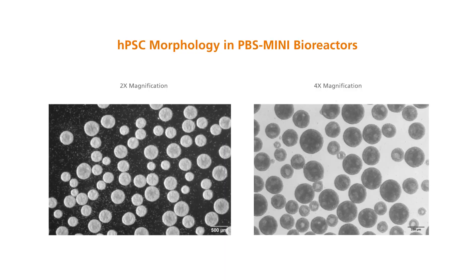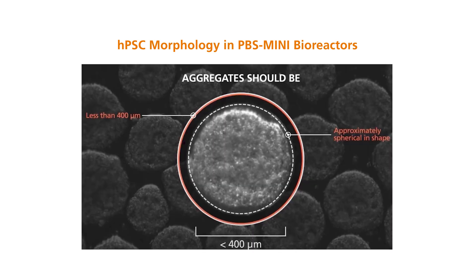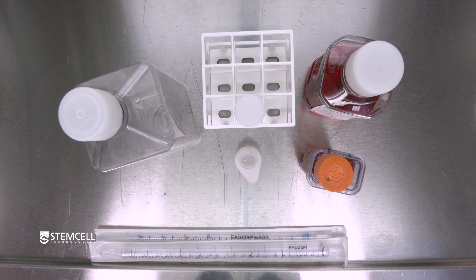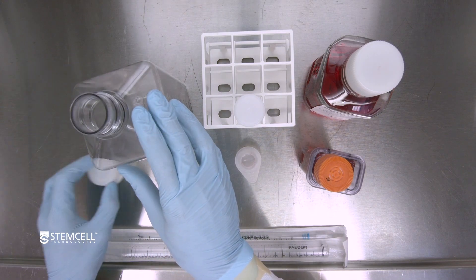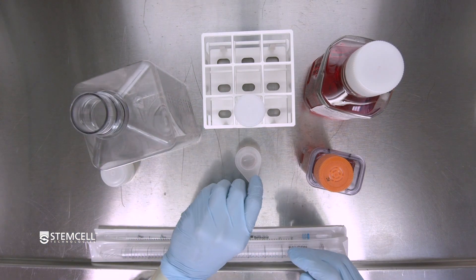Typical aggregate morphology on day 4 of a culture demonstrates an aggregate size of roughly 300 to 400 microns in diameter, and the aggregates look circular with dark marking in the middle. Next, place a 37 micron filter over the waste bottle.